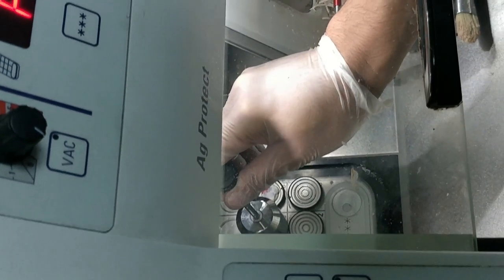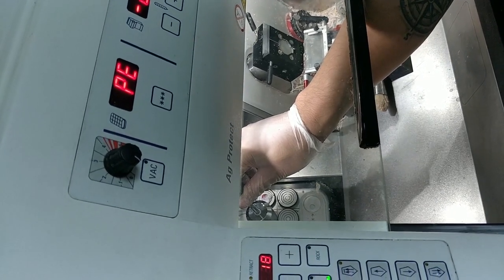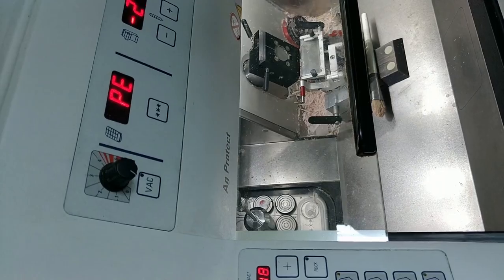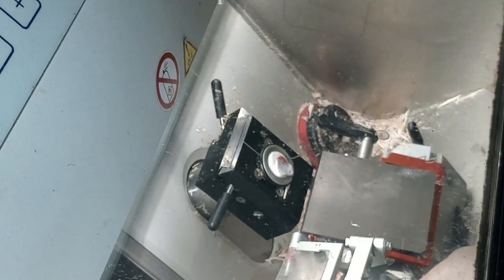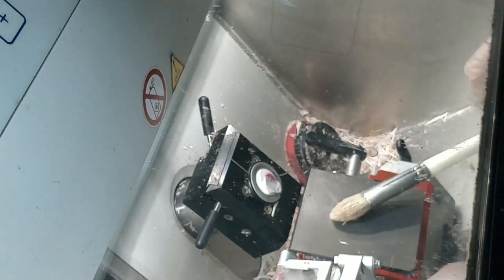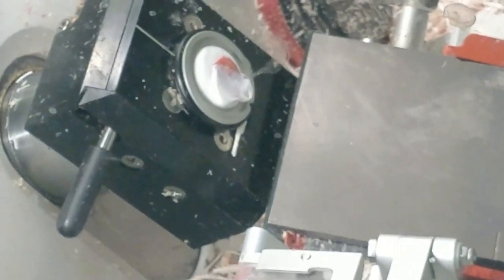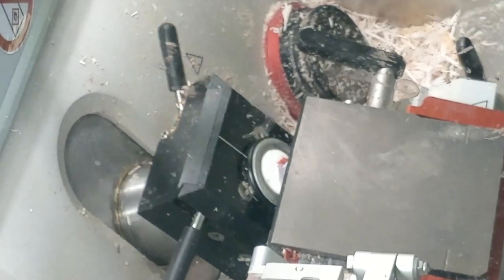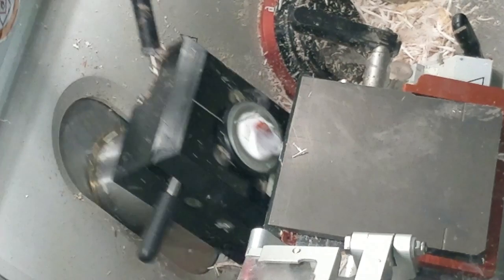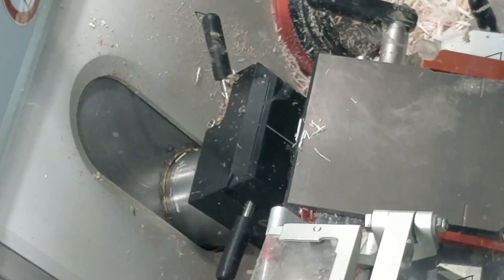Didn't it become flat? There. So, we place it on the block for cutting. Then, as you can see, there's a blade at the tip. It's just a razor blade. And then we trim it. We trim to expose the specimen.